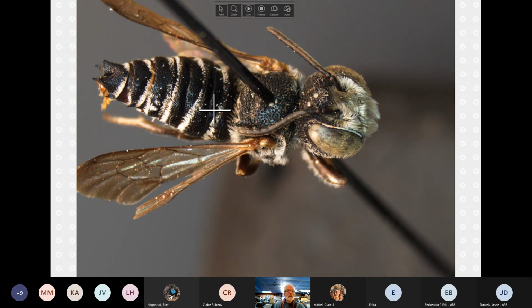So they're used within the guides too. And they're usually located about between the center line and the lateral edges, just to the, I think just to the north of the groove. I could be wrong. Maybe it's just to the south. We'll look at those a lot.